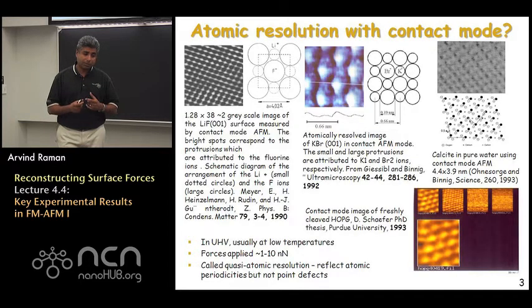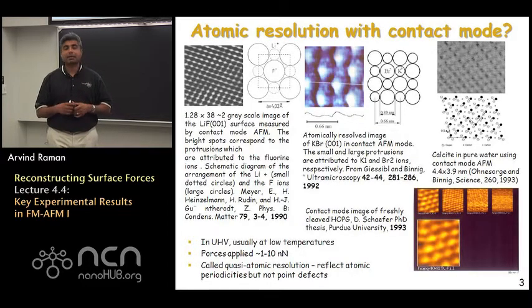What we're going to do today is to step back and take a long-term view of, from the inception of atomic force microscopy to where we are today. How has frequency modulated AFM or FM-AFM evolved in its ability to see features at extremely high resolution?